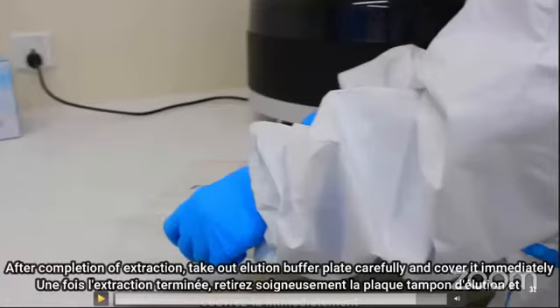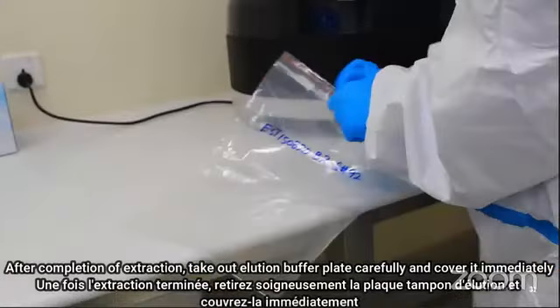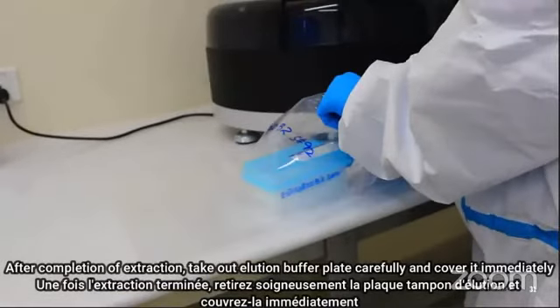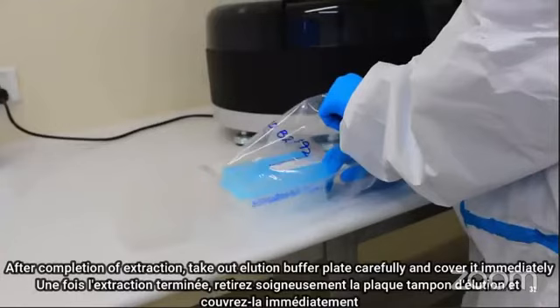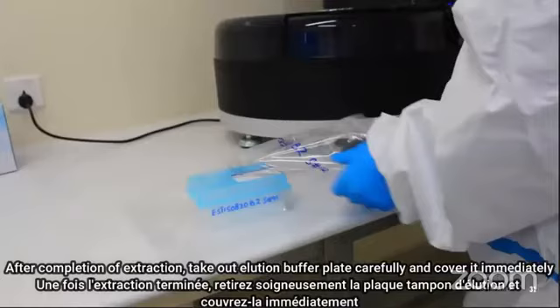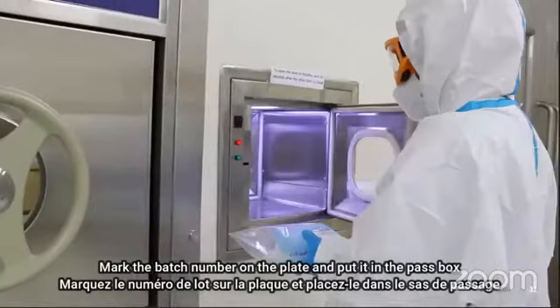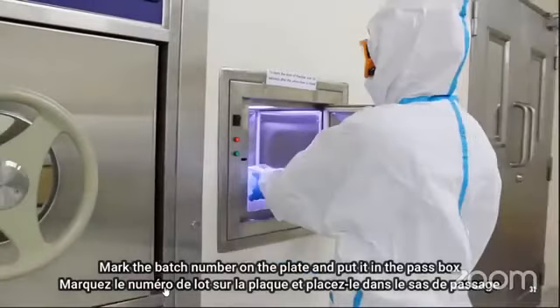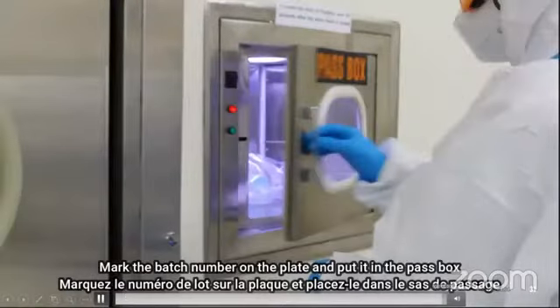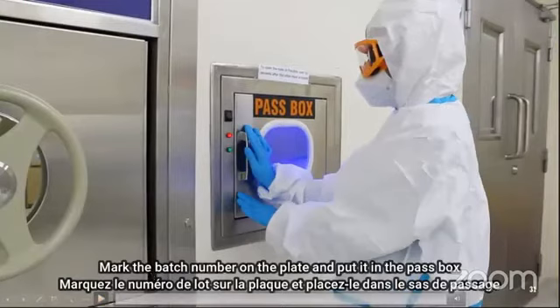Cover the plate immediately. And now transfer the plate through the pass box for further processing. I will again play this video for your understanding.